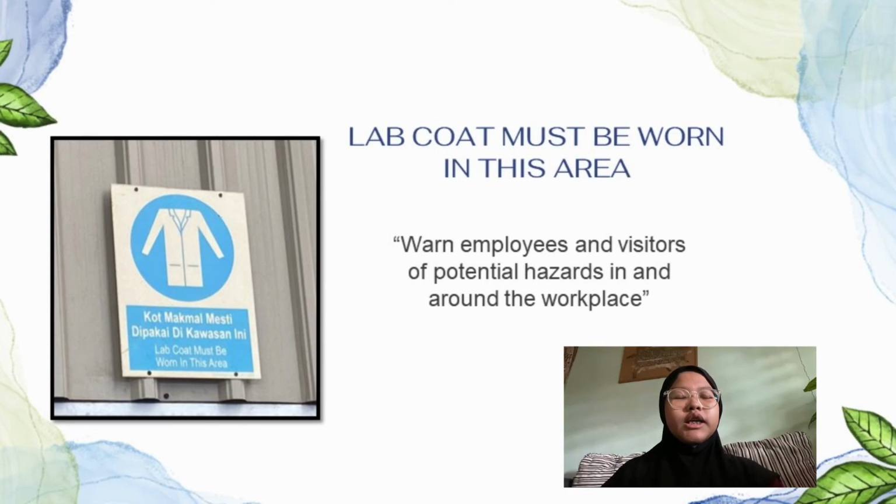Lab coats are a key element of personal protective equipment, PPE, in the laboratory. OSHA and the Centers for Disease Control refer to the use of lab coats or other protective clothing for use in laboratories while working with hazardous material.